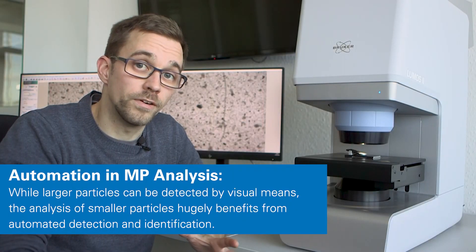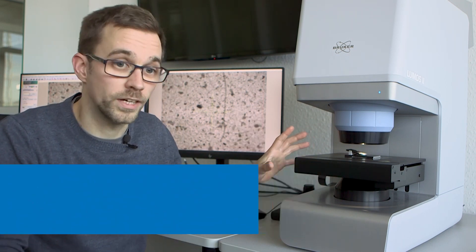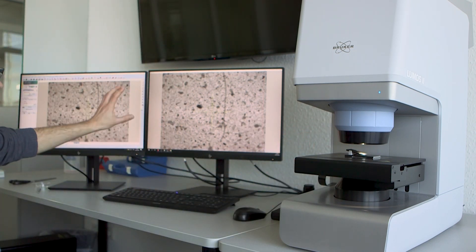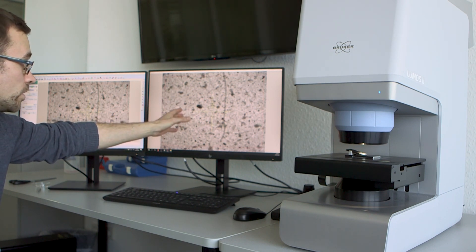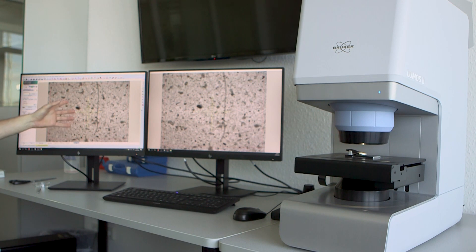In microscopy, it's very important to see what's happening to your sample at all time. This is why we have this dual monitor setup and on the first screen you can always see your sample and what's going on with it and the second screen to go through the guided workflow of the spectroscopy software.